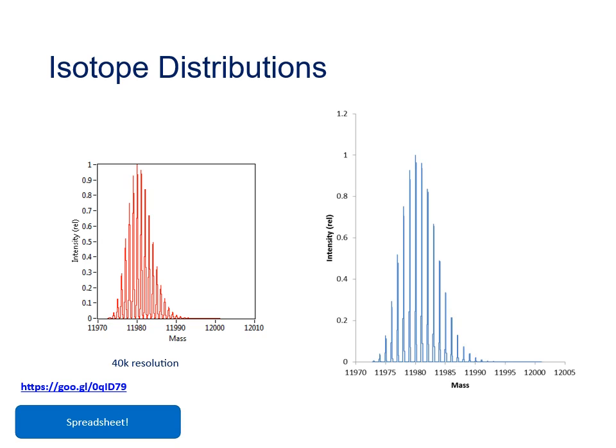But if we were to use older or lower specification instruments, we wouldn't get such high resolution. So if we analyse the same ion through an older generation time of flight, we might see the distribution look like this. And you can see the peaks are no longer baseline resolved, and they're starting to overlap. On a really modern quadrupole instrument, the resolution would be even lower. And on an old ion trap instrument, where we might only have a resolution of 5000, the entire isotopic distribution might appear as a single hump.